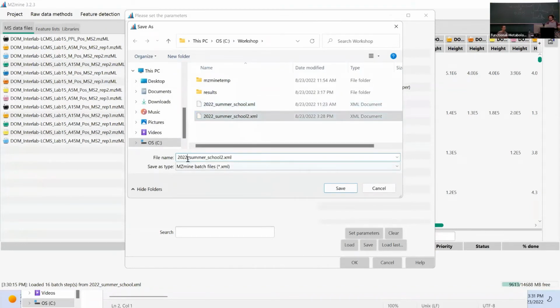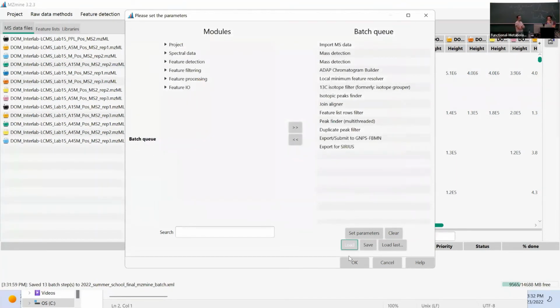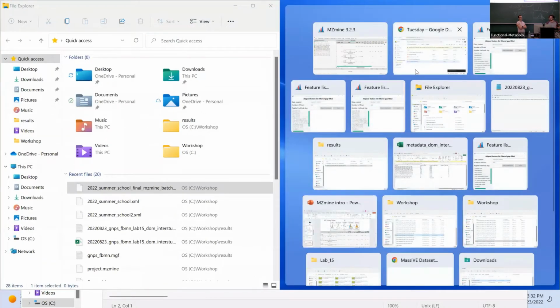Also, if you start with metabolomics data analysis, especially the beginners, be aware that this is frequent. This can screw up your entire downstream analysis. We want to equip you with, in our opinion, the best tools, but feature finding is really an important step where you can easily do things wrong. So yeah, just to reiterate on that.